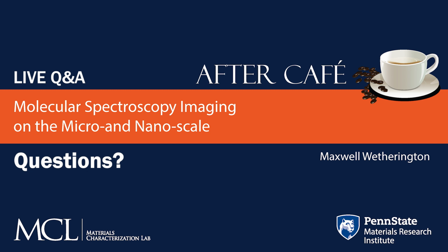Any other questions? Sorry, sticking with the preparation, I know so little about this. For sample prep, you talked about powders. If you were working with fine minerals, could you just crush those and then they could be prepared for Nano-IR or tip-enhanced Raman? Yeah.